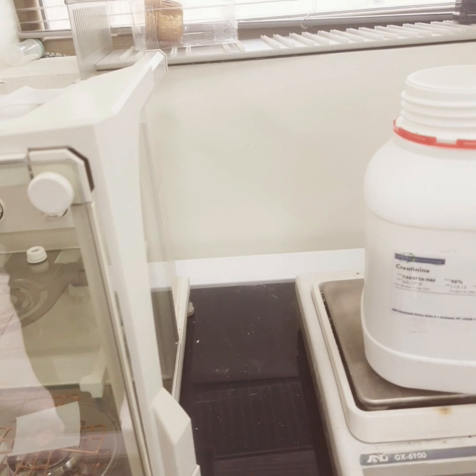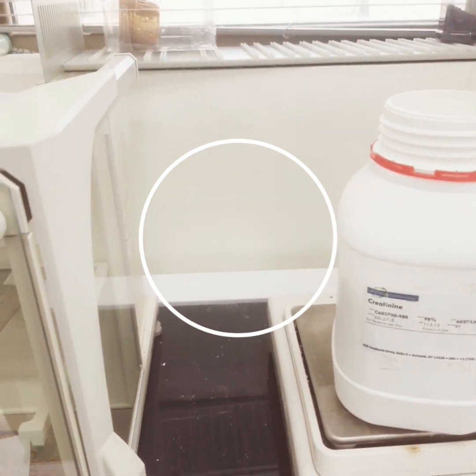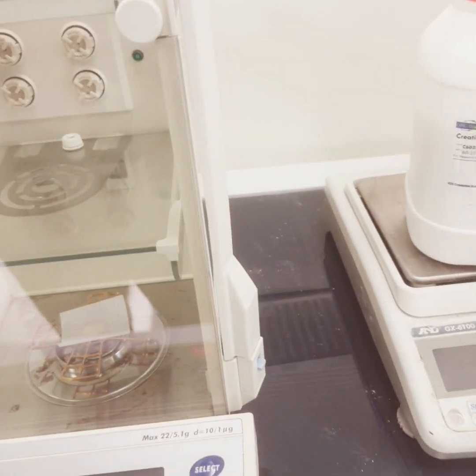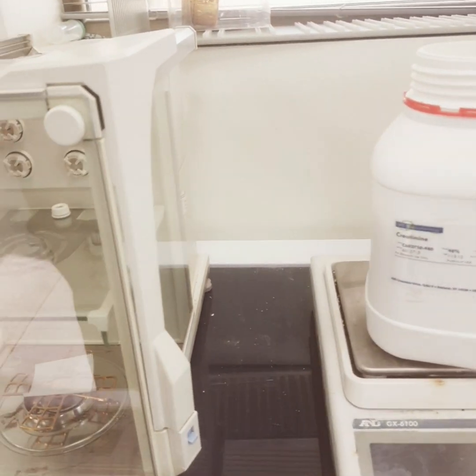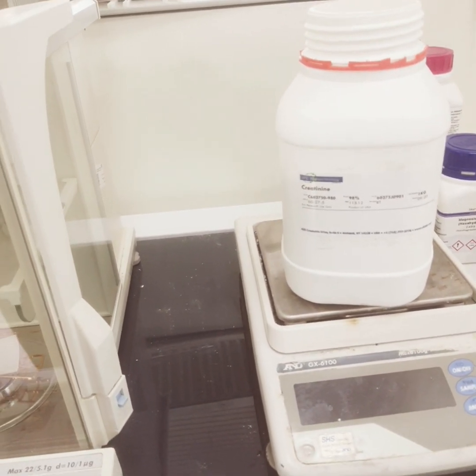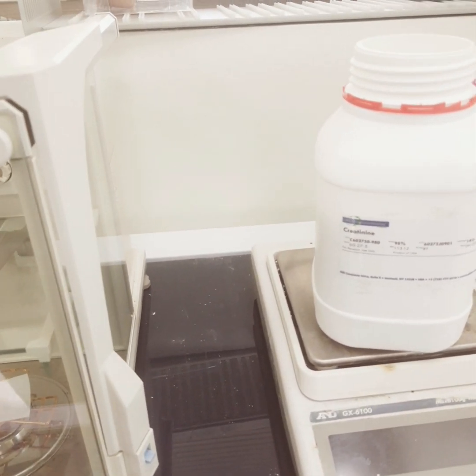And the normal levels of creatinine in the human blood for an adult should be 0.74 to 1.35 milligrams per deciliter, or in terms of micromoles it should be 65.4 to 119.4 micromoles per liter, and the low levels are 0.5 to 0.8. And the suitable method for the detection of creatinine is by HPLC, high pressure liquid chromatography, and the solubility at 20 degrees C is 90 milligrams per ml, okay, or it can be 90 grams, okay, in terms of milligram per ml only. You can convert that in grams per liter or milligrams per liter. And creatinine is highly polar, and it's insoluble in acetone or chloroform.